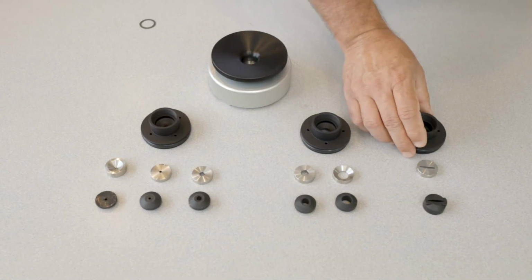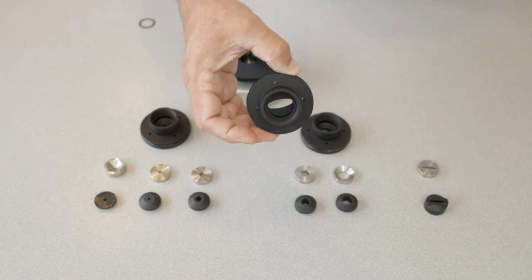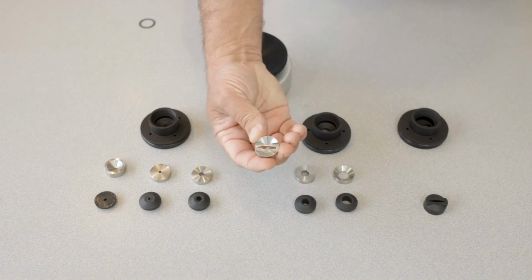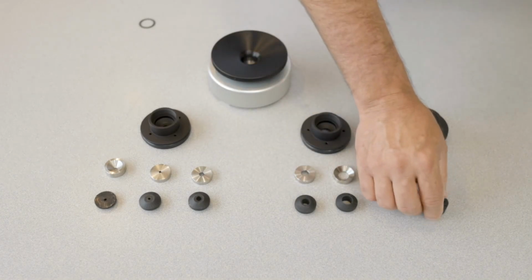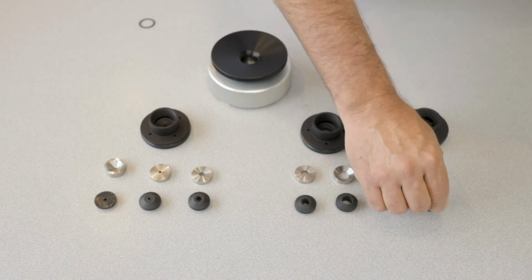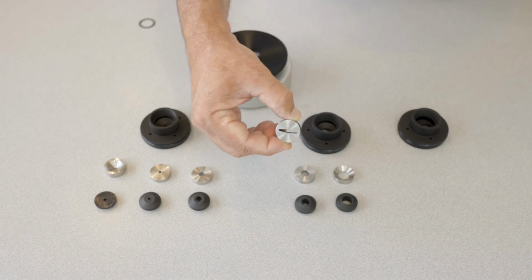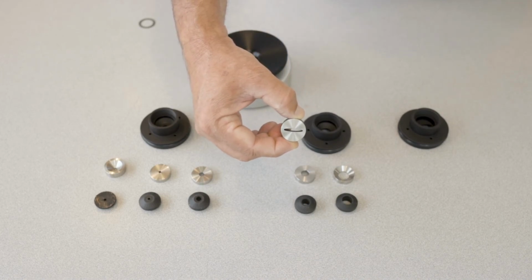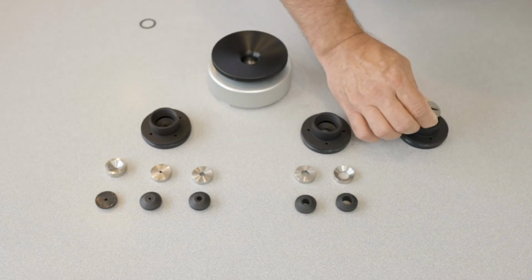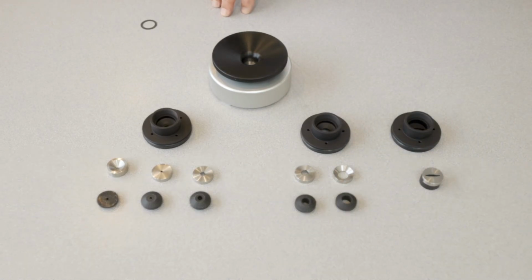The last system is the grass sealing system. So here's the grass base, and here's the gasket and insert. Very much different design than our other ones. But this is for sealing bladed grass, or it could be used for like corn. If you cut back the corn leaf, you could use it on that center rib. And that drops down here into the base, but it has a unique base just for that system.